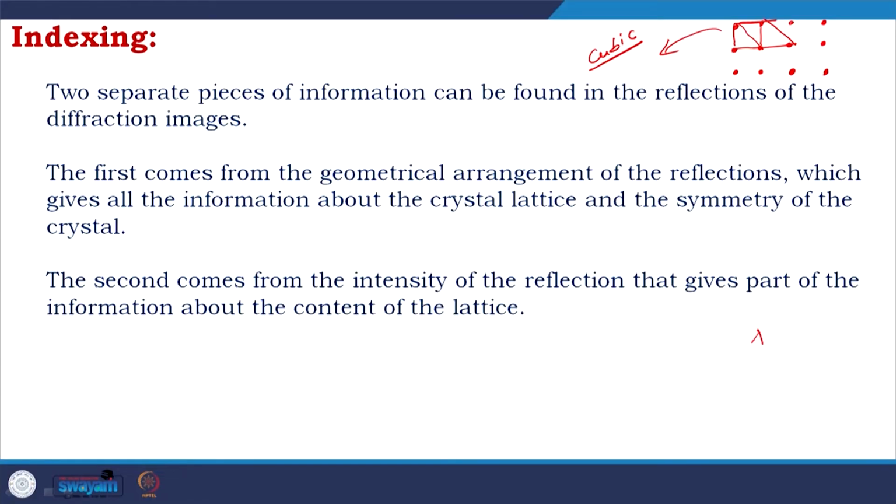But then there is a trick. Suppose I chose unit cell A and you chose unit cell B. You get lower symmetry and I got higher. Then I have to do less work than you. So, that is why there also needs to be a step called optimization of the choice of unit cell. That is important.